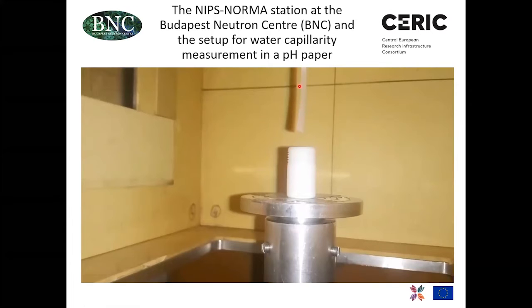And up here you see a pH paper, and we gradually move this pot of water up until the water level reaches the bottom of this filter paper.